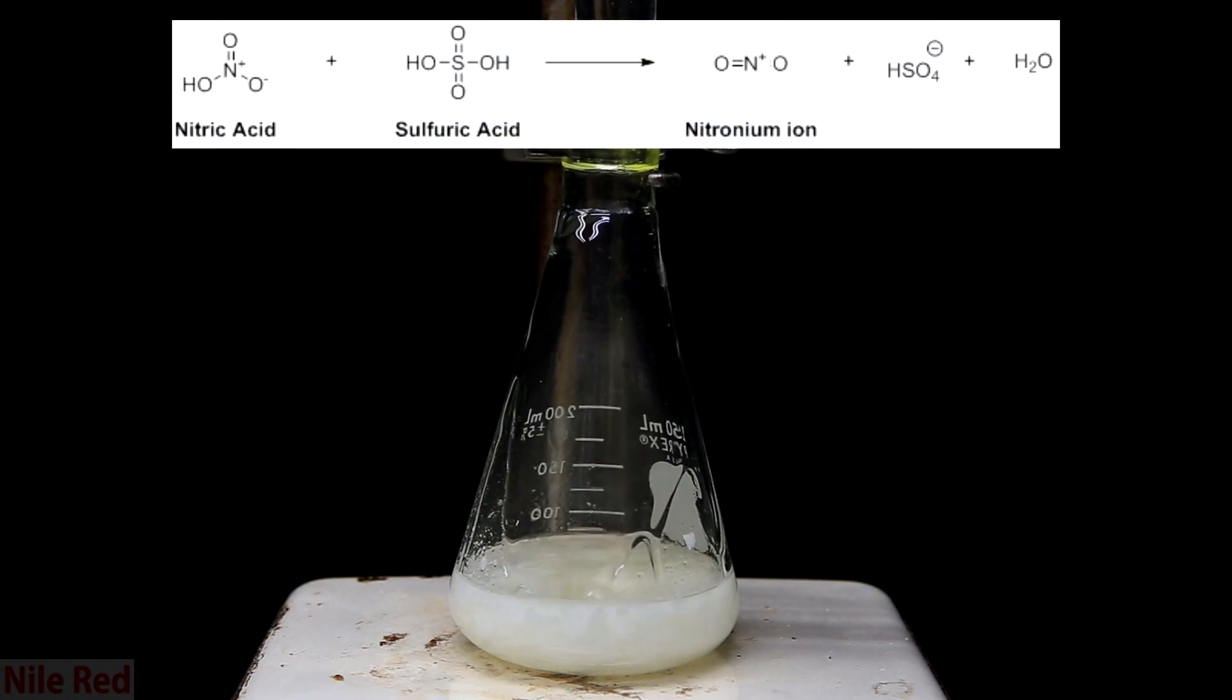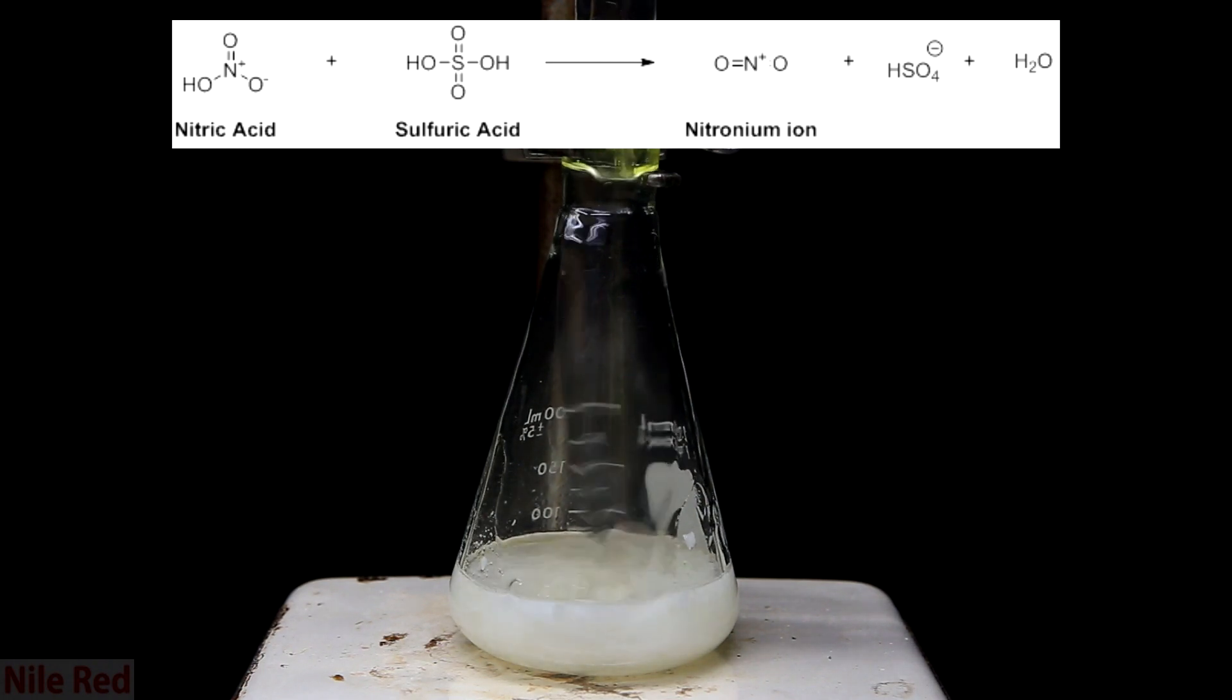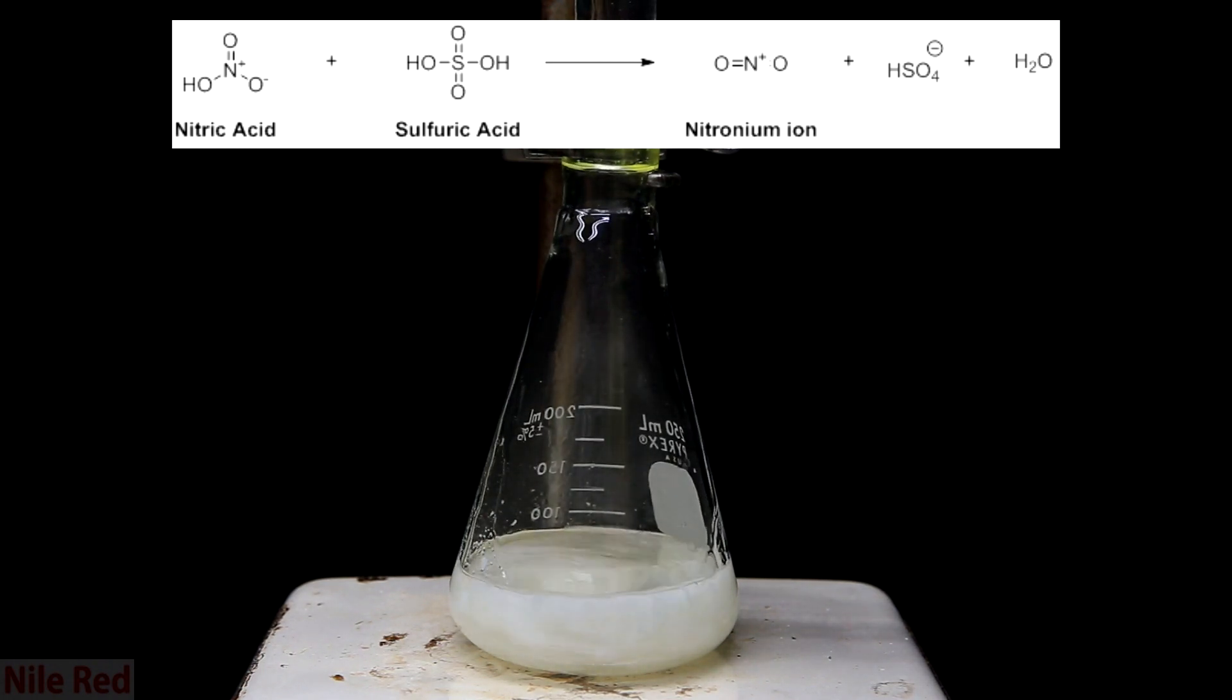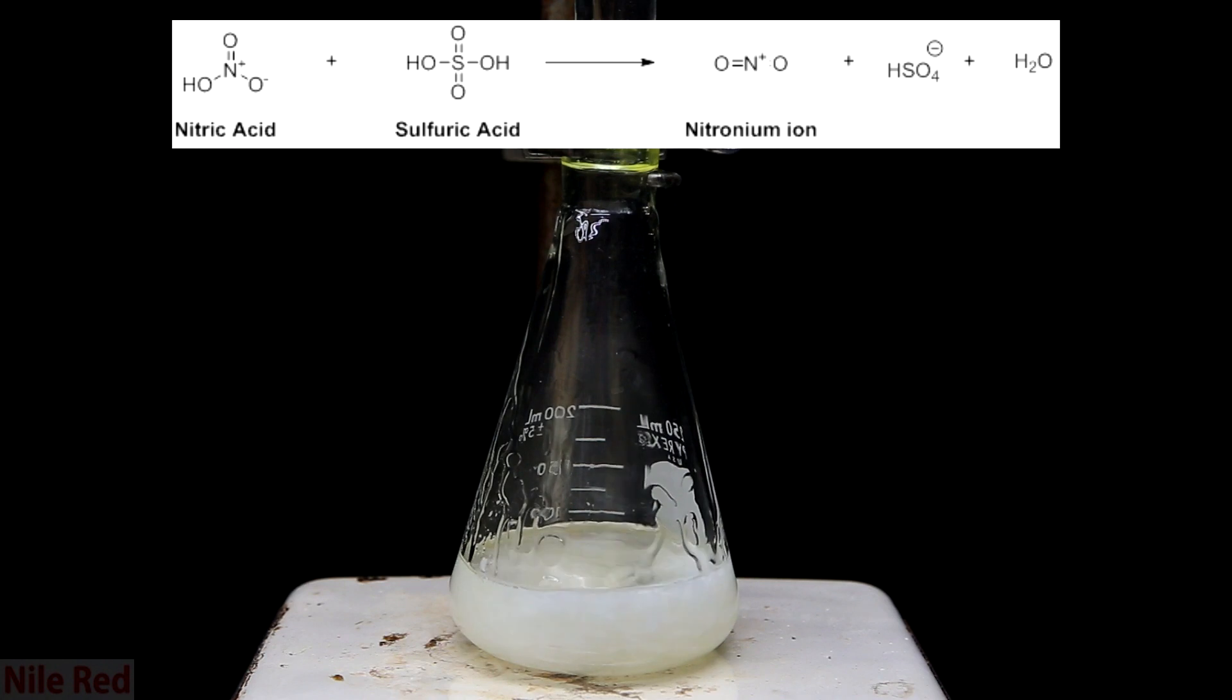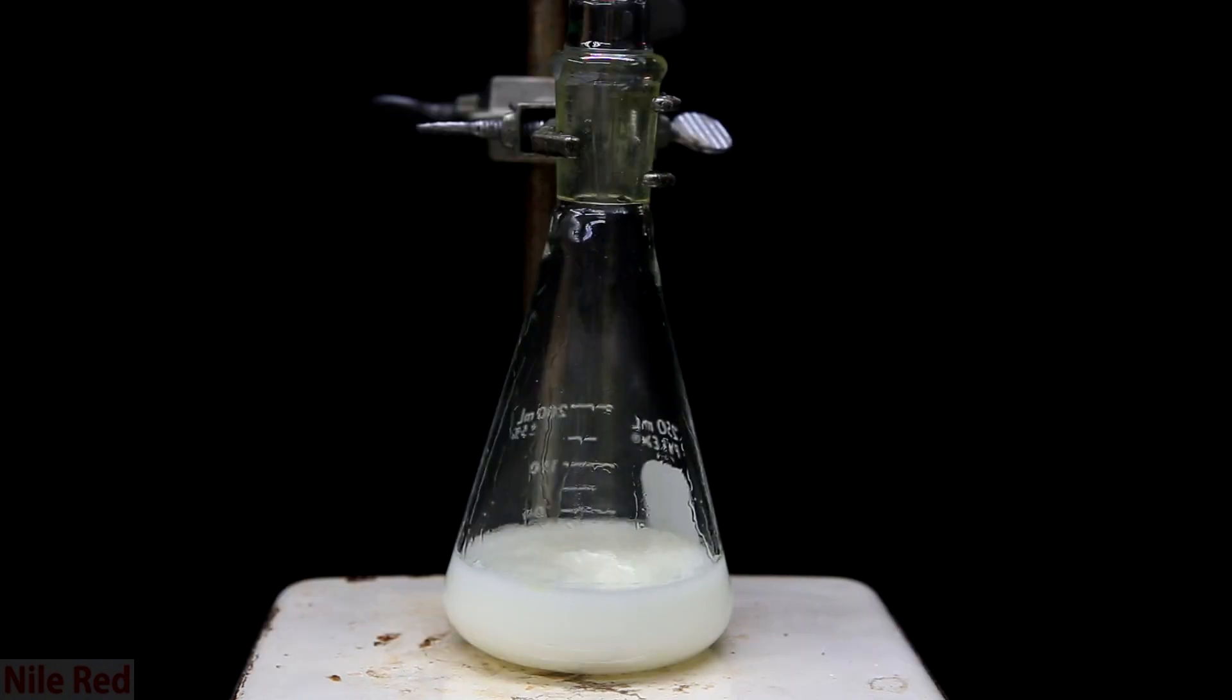We use this mixed acid system because the sulfuric acid reacts with the nitric acid to form the nitronium ion. Nitric acid alone won't work really to add an NO2 group and we really need the sulfuric acid to prepare it. It's stirred for a little while at room temperature and it becomes this opaque white color.